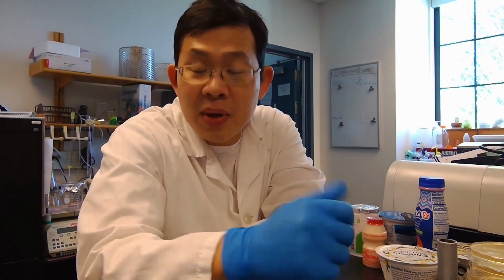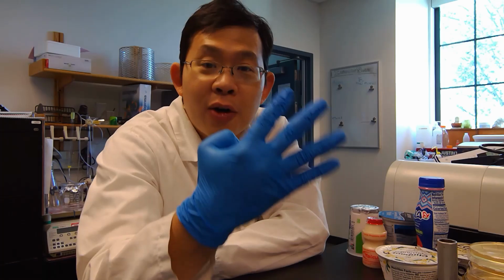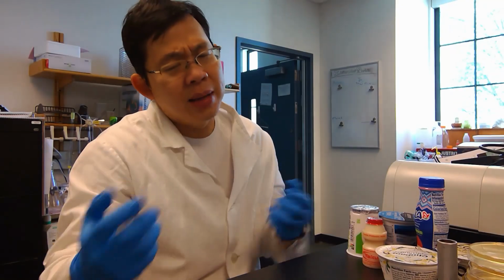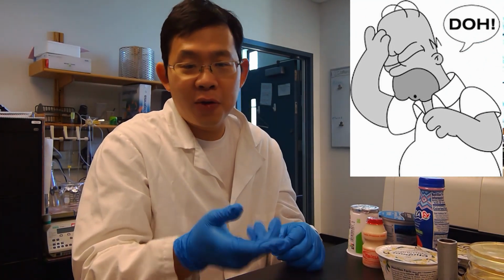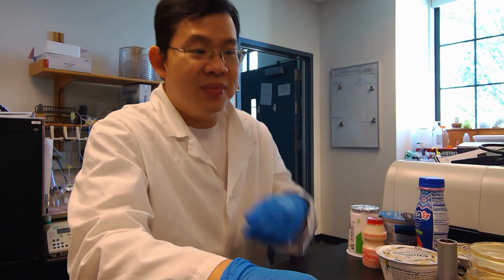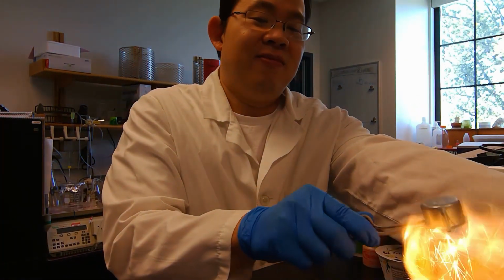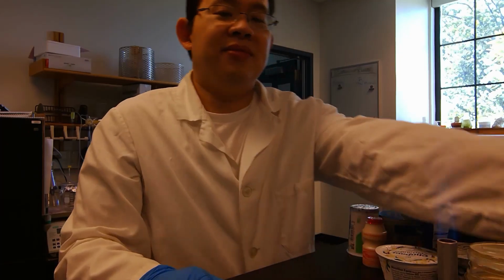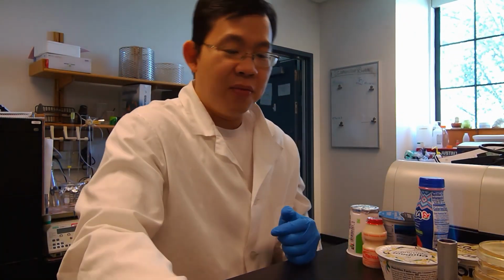Well, today I am going to simply perform one type of streak isolation, which is probably something you learn in microbiology lab, and that is what we call the 4-quadrant streak. As the name suggests, it has 4 quadrants. The first thing that we need to do is, of course, to get our Bunsen burner up. So here is the Bunsen burner. I'm going to turn on the gas. There you go. So now let's start with the loop.